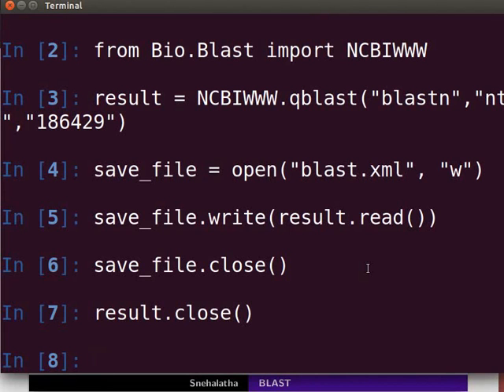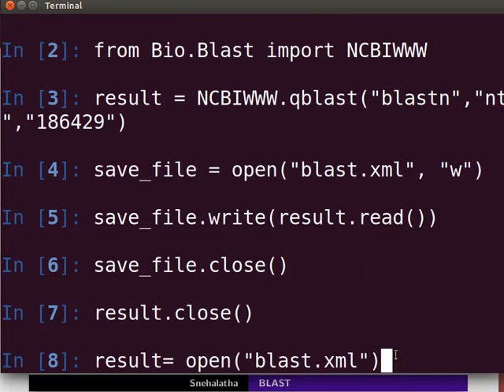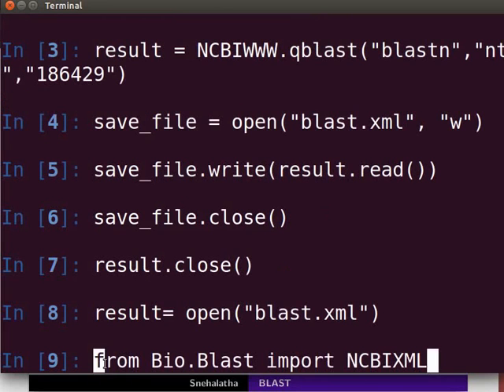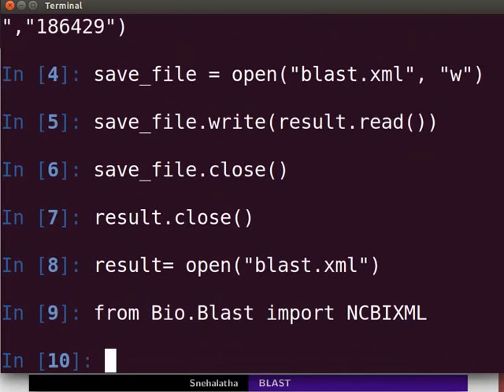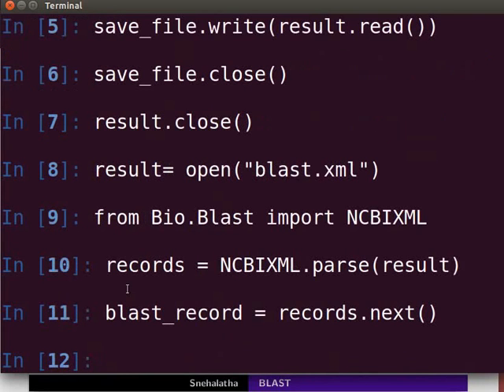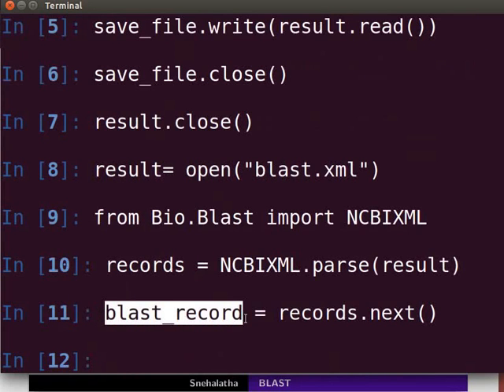Back to the terminal. The next step is to parse the file to extract data. The first step in parsing is to open the XML file for input. Type the following at the prompt and press Enter. Next, import the module NCBI XML from the bio.blast package and press Enter. Type the following lines to parse the BLAST output. A BLAST record contains all the information you want to extract from the BLAST output.